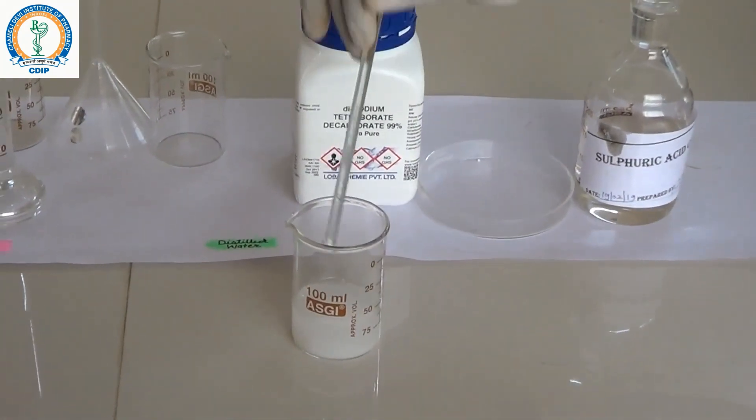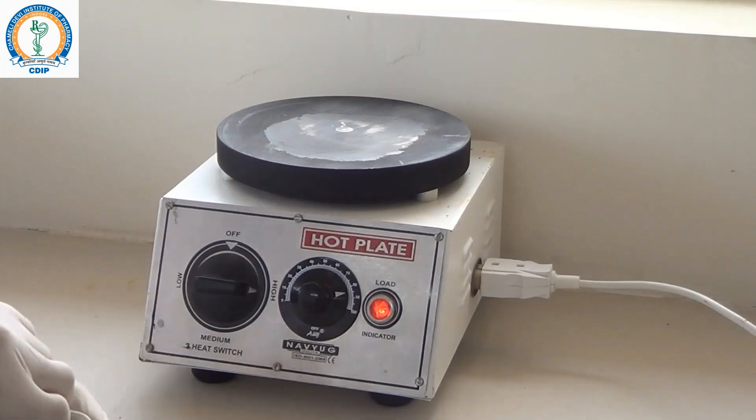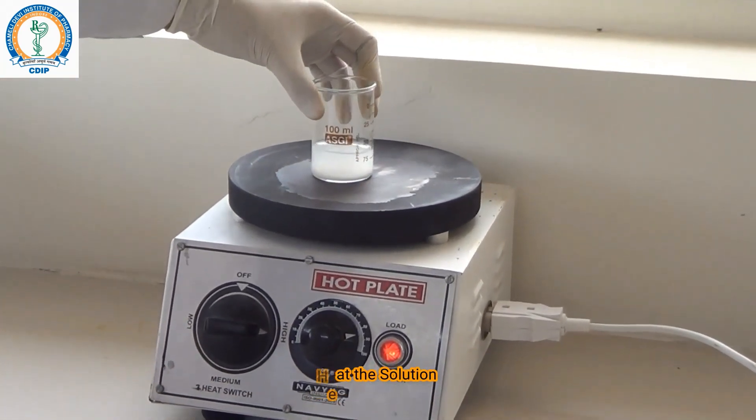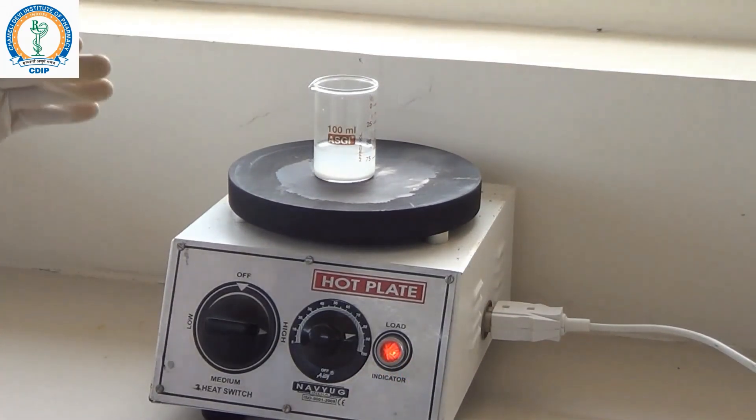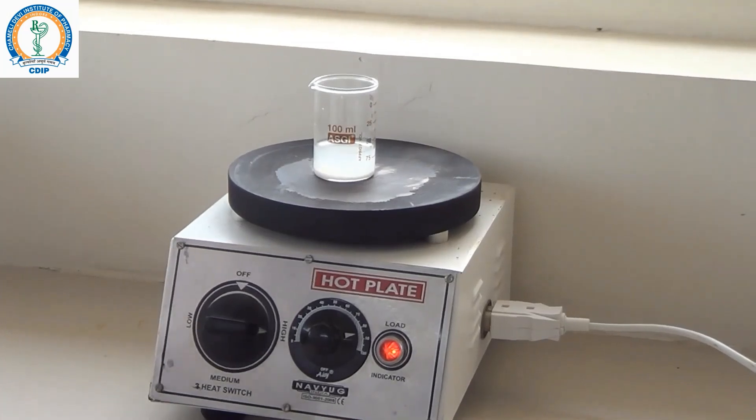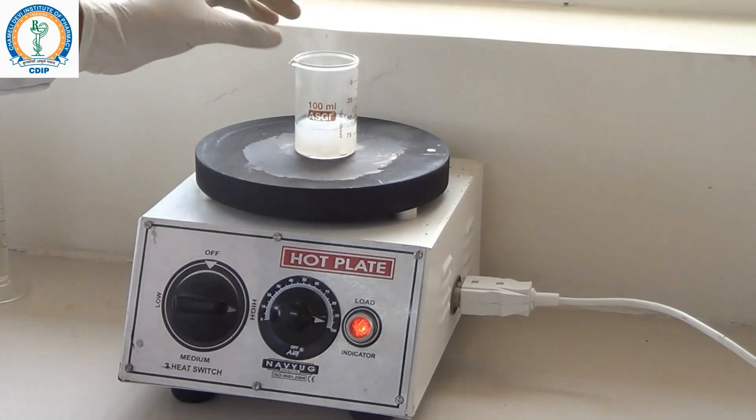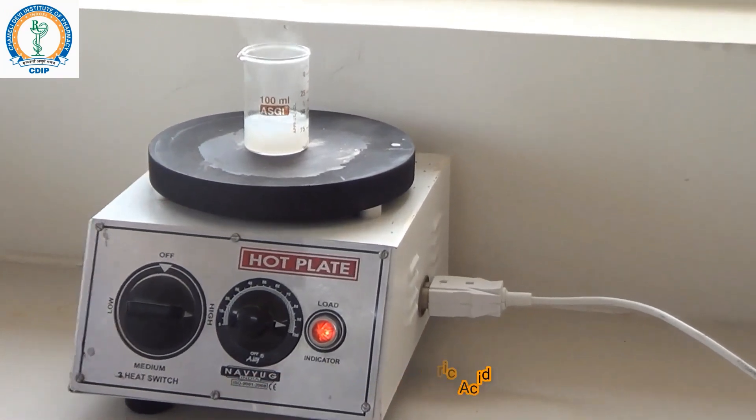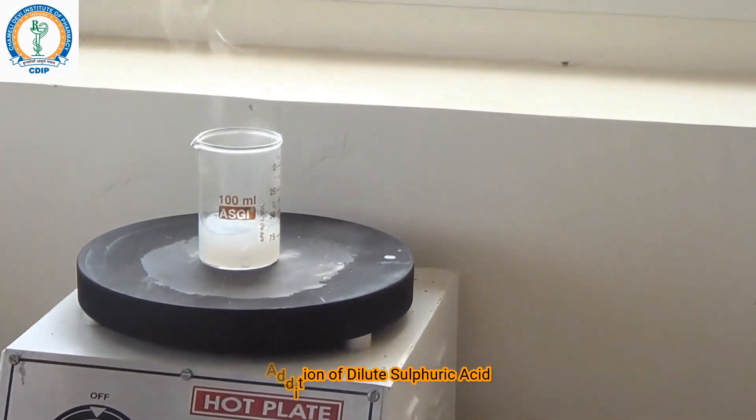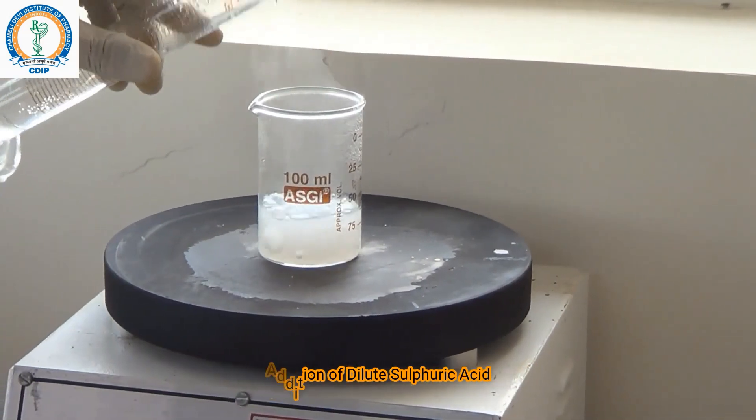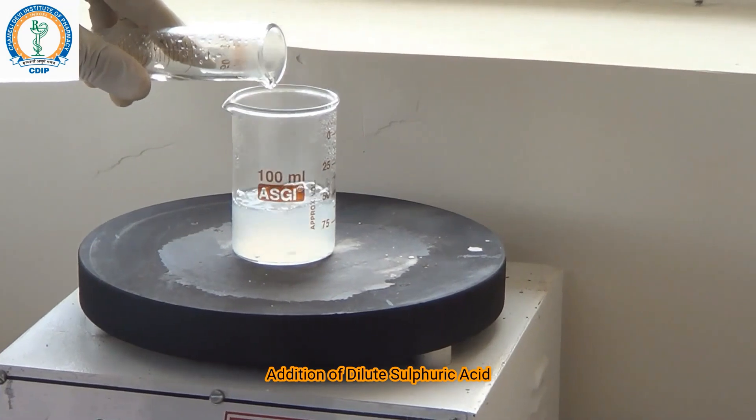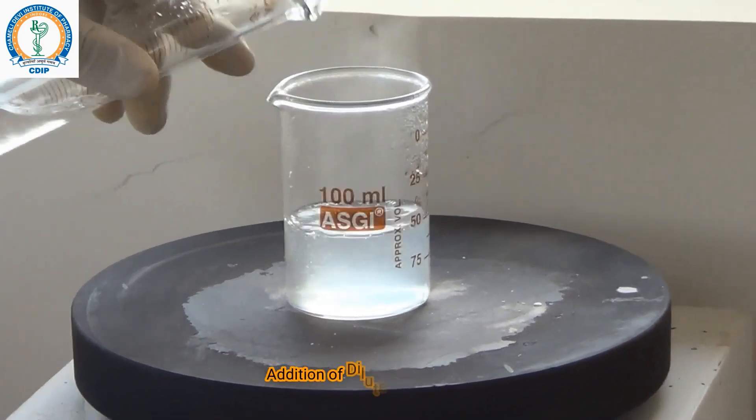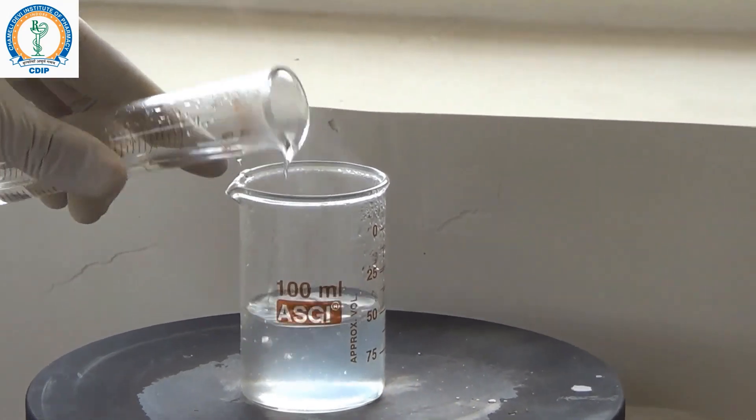After mixing, transfer the beaker onto a hot plate to warm it until boiling takes place. Now you can see the boiling is here in the solution. Now add 10% volume by volume H2SO4 to the solution and boil the solution for some time.